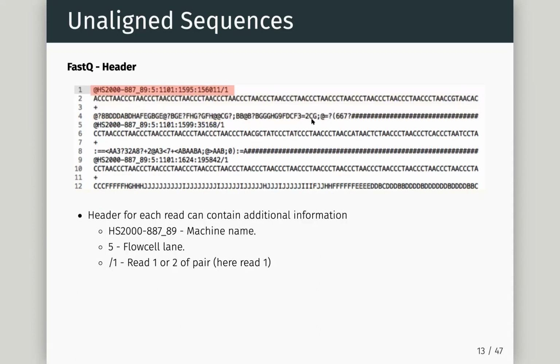So that header line is really useful in a Fastq. If you're ever in trouble and you can't remember where you sequenced this, or whether this is genuinely my Fastq, it's your header line which contains all this information to help you track back. And when we submit this to repositories for our publication, often they will scan this header line and it will tell them it was sequenced on this type of machine, etc.